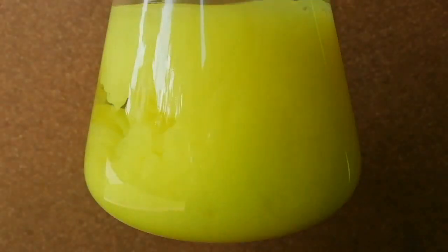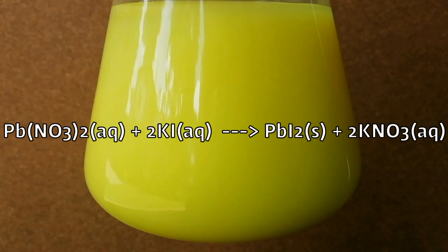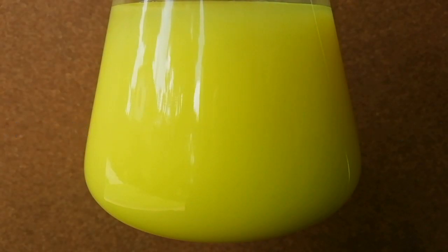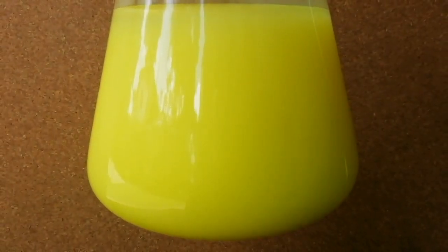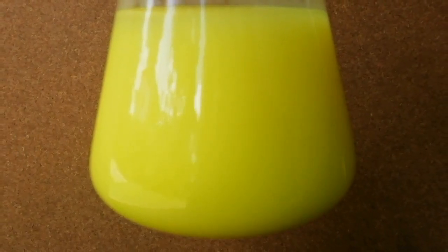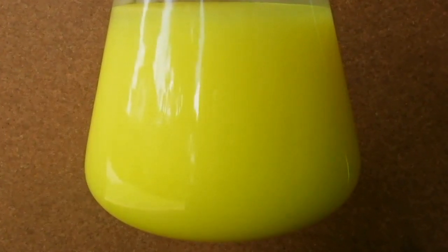Then I add the lead nitrate solution to the flask. In my case I had to heat the mixture again to dissolve all the lead iodide.